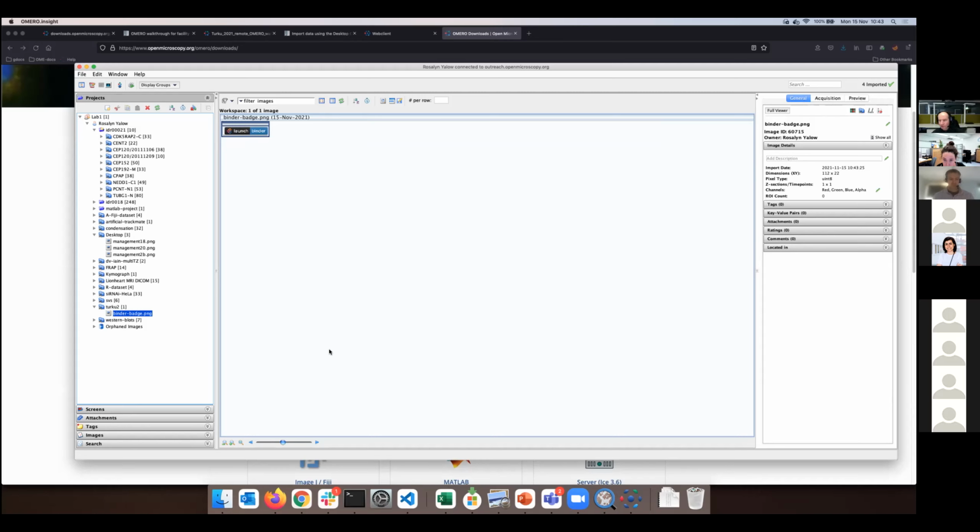I'm importing ridiculously small PNGs to save time, but of course, you might play with that. Nevertheless, don't import gigabytes. Please stay within 100 megabytes during the training, because we have size limits on the server, and we would not be able to sustain that. The server, as it is, will be available for you, ladies and gentlemen, for 14 days after the workshop. After that, you can consider the data out of reach for you, and you are not able to use that particular server, which we are now offering, which is called Outreach.